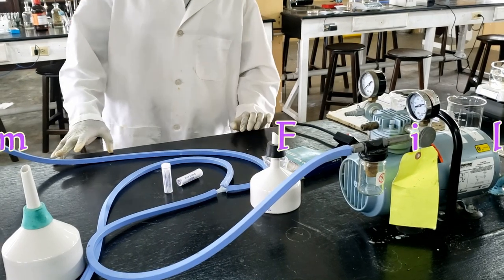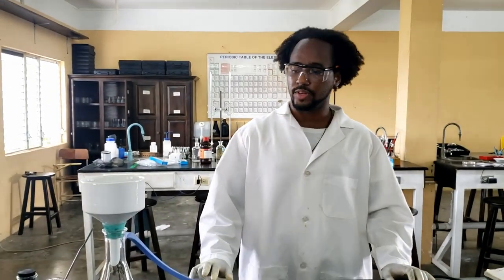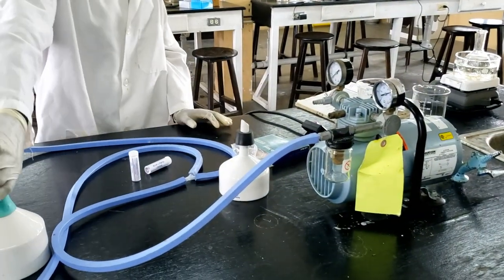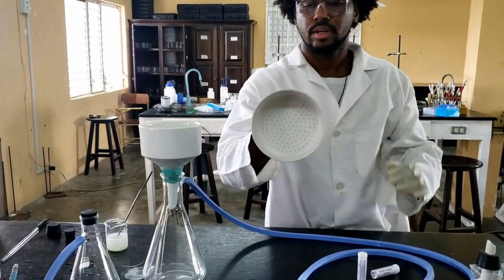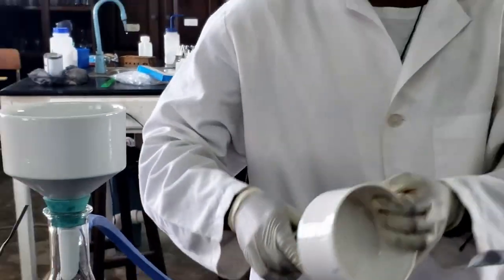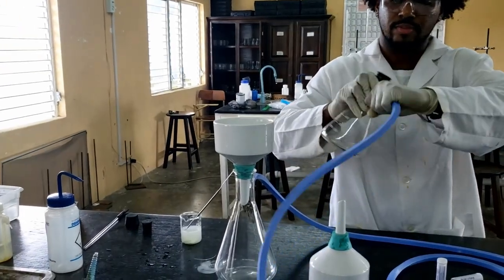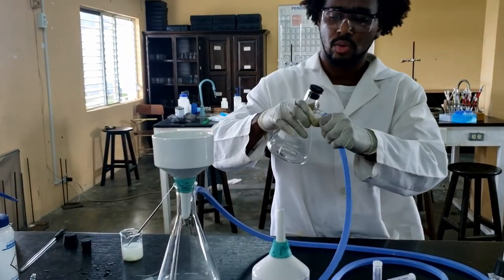Another key concept that you'll be exploring for the first time in this lab is the use of the vacuum filtration process. What we have here is a vacuum pump. We're using Buchner funnels. These are large funnels, and they're perforated. You can see the little holes inside. Normally that goes inside a vacuum flask, which is just a conical flask with an extra hose adapter.